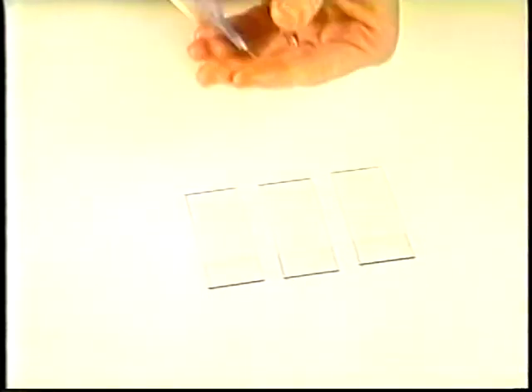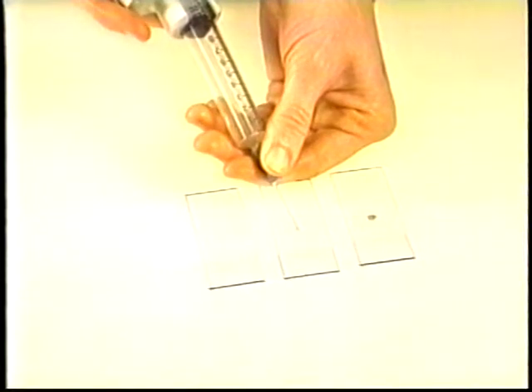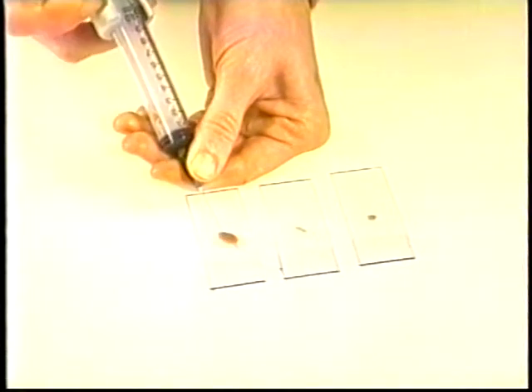If there is abundant material, especially if there is admixture of blood, it may be desirable to divide the material among several slides. To accomplish this, push the plunger with less force and stop when there is enough material on the first slide. Move to a second slide and repeat the procedure until all the material has been deposited.